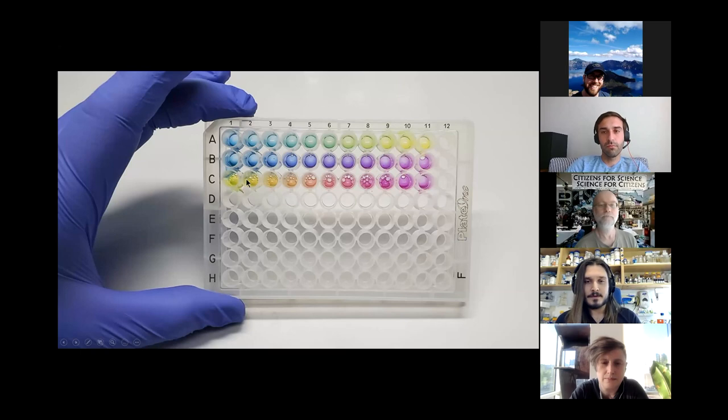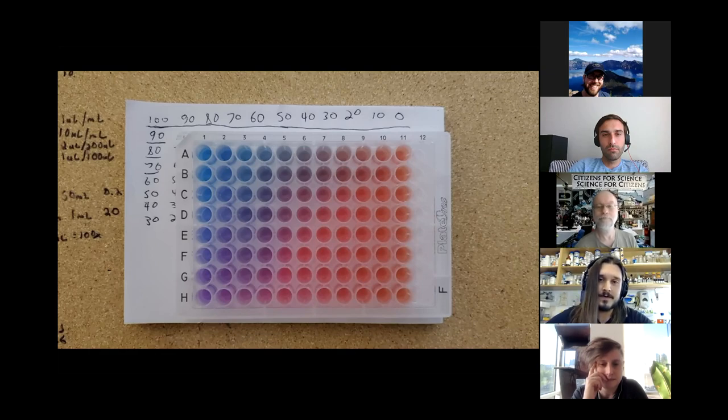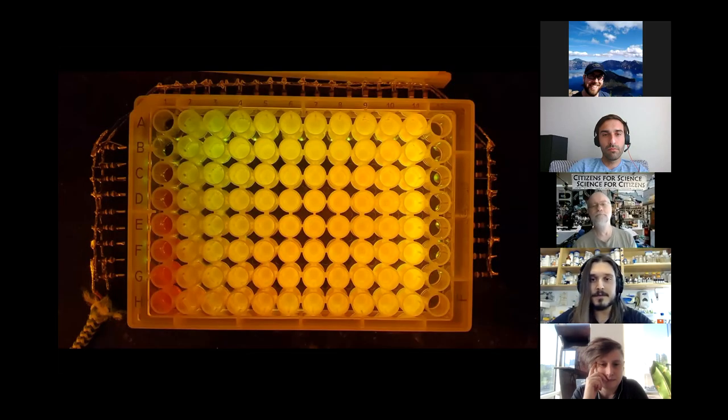The stepwise gradient was, I think, 10 microliters in a 200 microliter well plate. Then I got bored and thought, okay, let's do a really interesting gradient, with concentrations going this way and that way and downward with the three colors. Yellow got lost, but surprisingly, if you put them under fluorescence, yellow's the loudest there. You can fine tune the different amounts of this fluorescence, so now you have a different color space, the fluorescence color space, to play with if you're doing genetic design work.